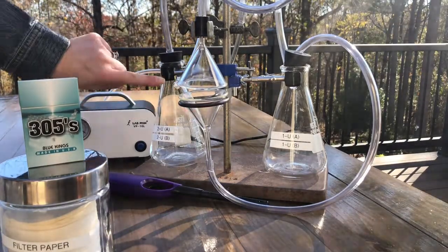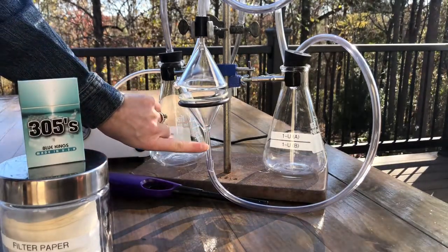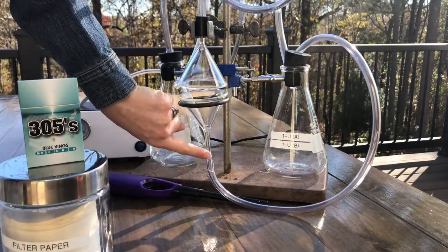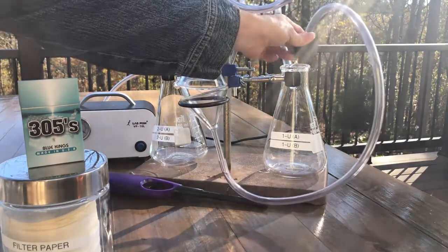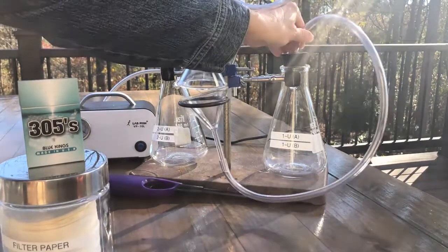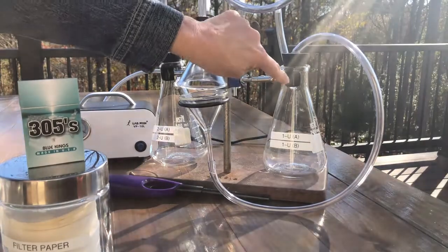This is gonna represent our second-hand smoker. So when we turn on the pump, it should start sucking air through that cigarette, causing it to burn down, just like it would if someone was inhaling it. So that smoke should come through the tube and down into this flask. But what we're gonna do is put a filter right here between the tubing and the flask, right underneath the stopper. And that should catch all the solids, okay?